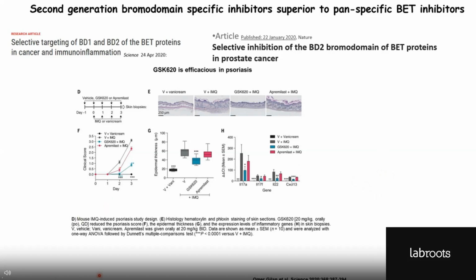So that is what I have to talk about, and I can tell you that a lot of this transcriptional output data that we have had was extensively enabled by using this TECAN machine, which would not have been possible, or rather, it gave us more confidence in terms of how libraries were made using that machine.